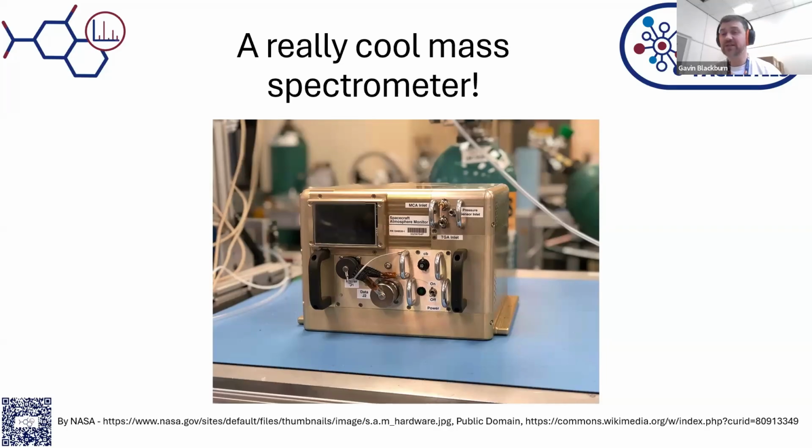And they do have some other sensors. There's an IMS sensor up there as well. But that meant that they couldn't get in situ real-time measurements. So this instrument was built as a really, really robust, small GCMS that could be flown up to the ISS and sit there and continually measure the air quality and send that information back.